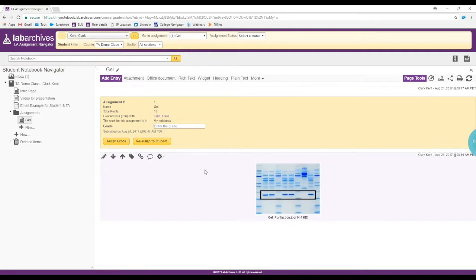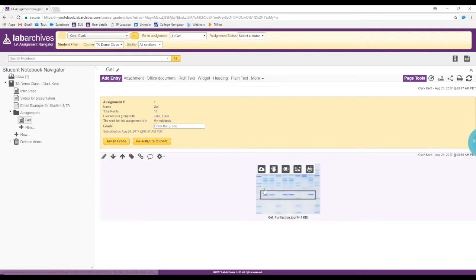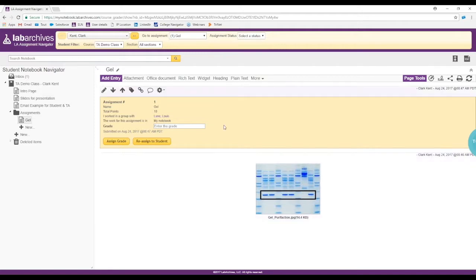When you click on 'gel,' it finds that assignment in the student notebook. It's a picture of a gel, and the assignment was for students to annotate part of the image. What you're looking at here is what we call the assignment entry. You don't have anything to do with this other than looking at it, because the instructor already set this up for you.